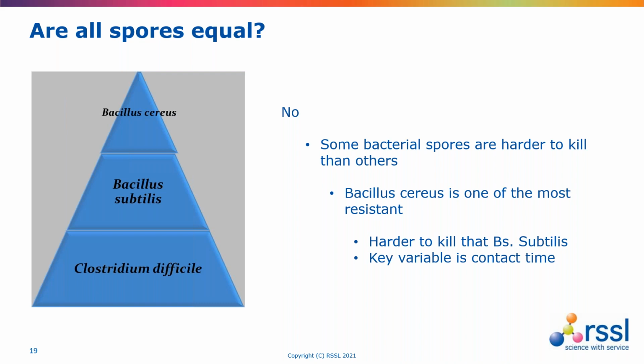So there are sometimes differences in the spores. The spores selected for disinfectant validation should bear some connection to what's being recovered from cleanroom environmental monitoring.